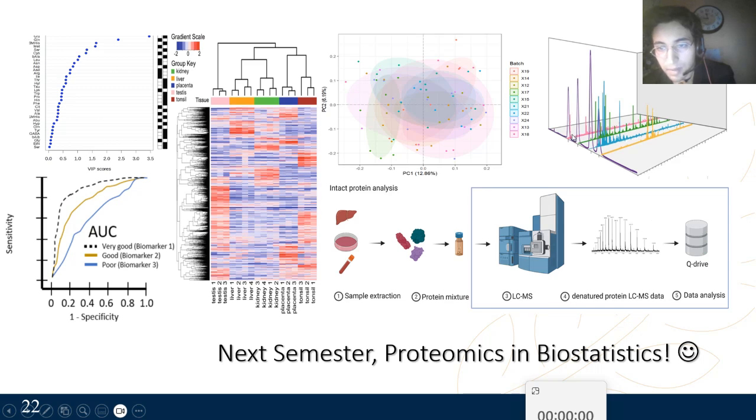So look at this peak. There's something here, right? Then the smallest and most, oh, there's another peak over here. It has to be something important. Then you go through this, and oh, also, where does this peak come from? Okay, this huge peak is actually all of these peaks added together. It's called the TIC, total ion count.